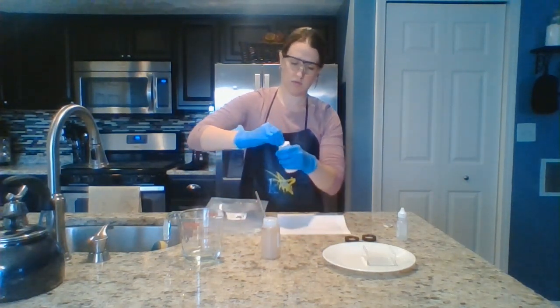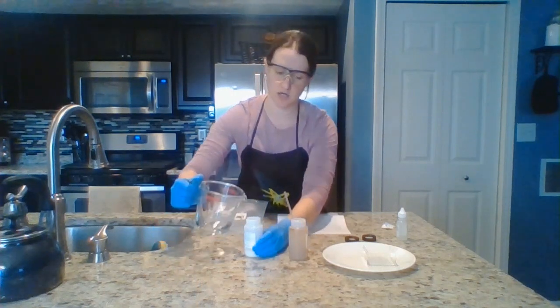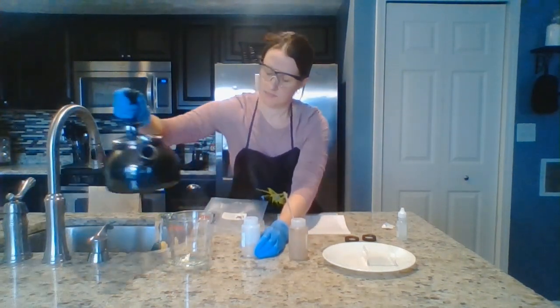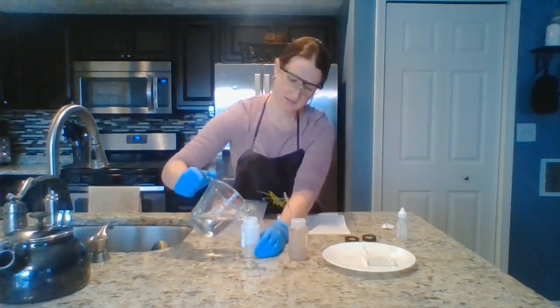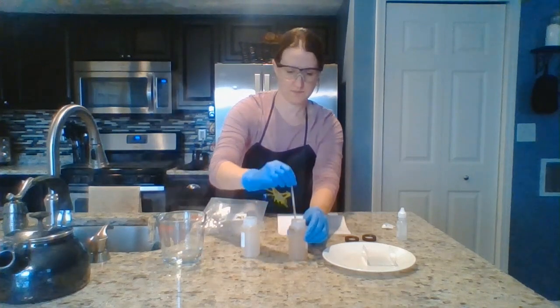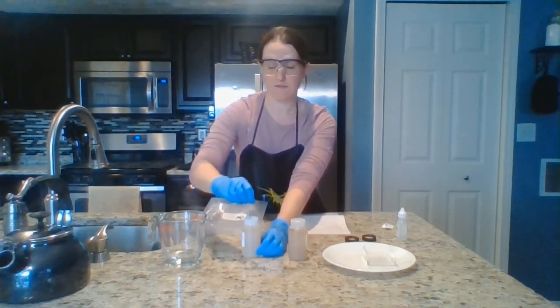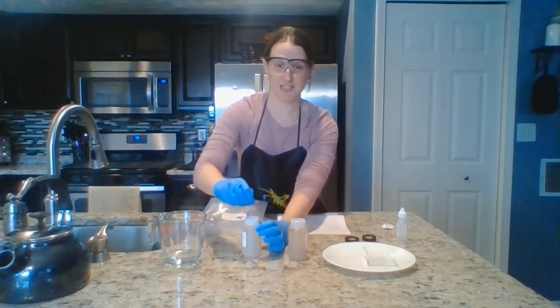Open up this second bottle. Once again, I'm going to pour boiling water up to the neck of the bottle and stir till it's all dissolved. Need a little bit more. Once it's stirred, it should be kind of a brownish tan color, and it's going to smell kind of weird. And that's because agar is used as a food source for microscopic organisms like bacteria. So to bacteria, it smells good. To us, it kind of smells weird.